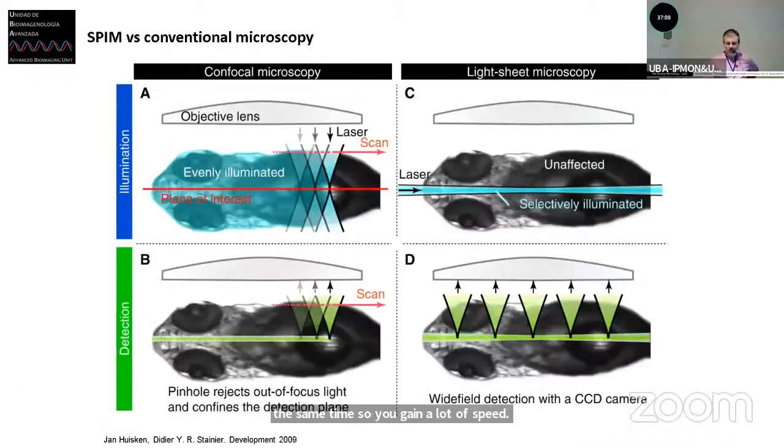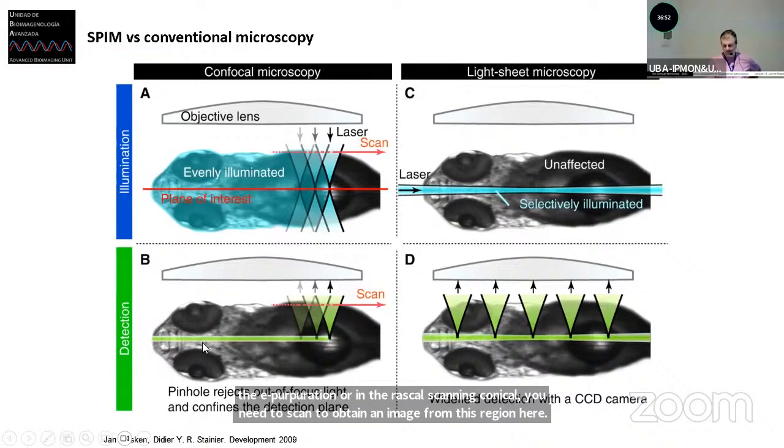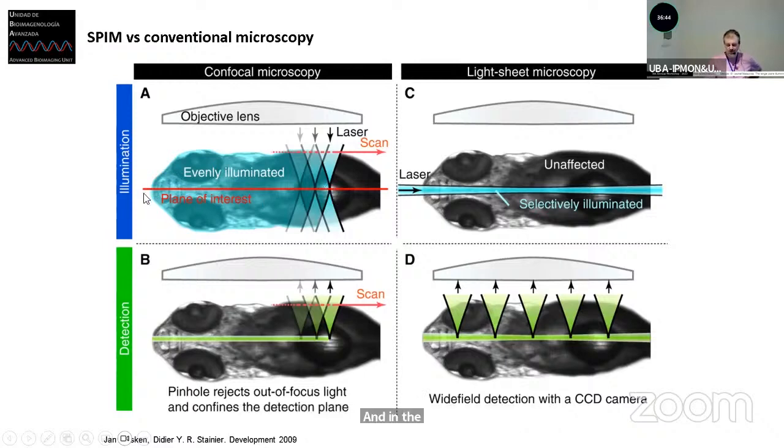So this is explaining this comparison between SPIM and conventional microscopy. When we have either epifluorescence or raster scanning confocal, you need to scan to obtain an image from this region here. If you are in a confocal, you illuminate all, but you pick up only this region because you have the pinhole. In the epi detection, you have basically blurred information because you have out of focus. Well, with the light sheet, you illuminate with a sheet of light like this, and then you pick up at 90 degrees. So basically, you don't have out of focus, and you are illuminating the plane that you are imaging. You are not illuminating regions of your sample that you are not taking care of. And this is very powerful because you are only spending time in your sample with your light just in the place where you are taking your images.